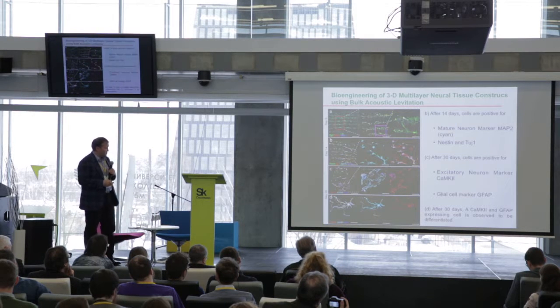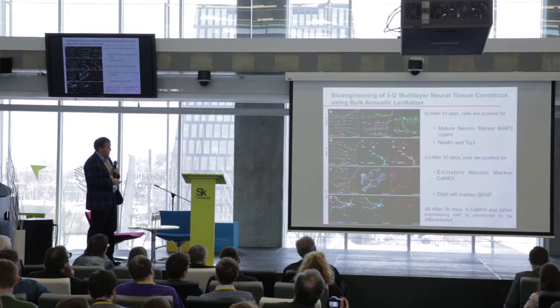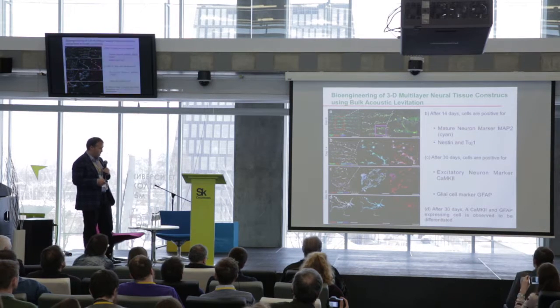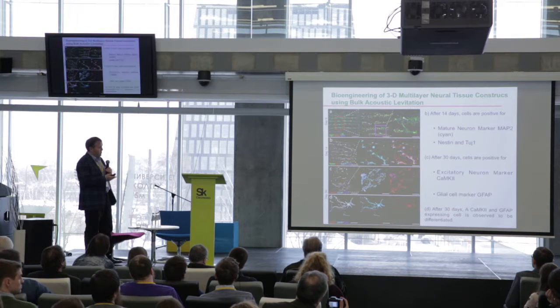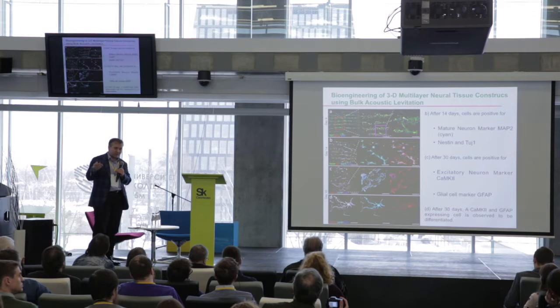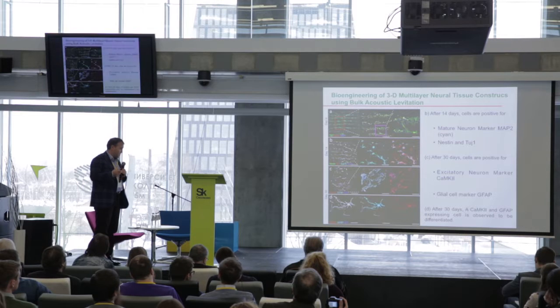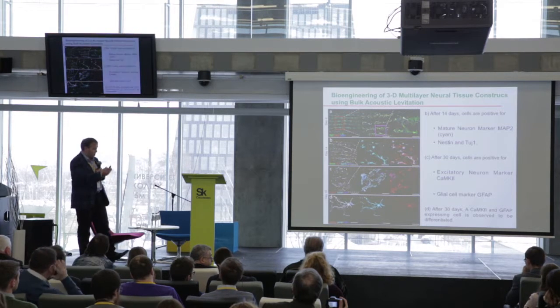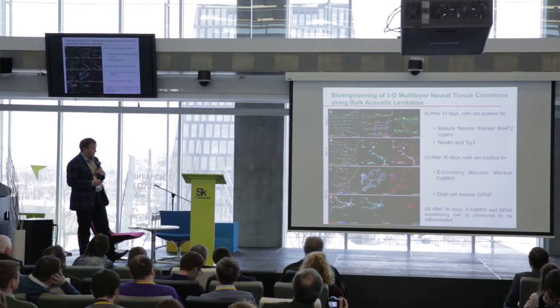But the bottom line is we have been able to take these cells and differentiate them over a period of 30 days, and these are biodegradable gels. Going above 40 days has proven to be challenging, but these were human cells, so we needed at least 6 months to really differentiate them to be functional neurons, and that's why we now have switched in the lab, again, back to mice, which mature much faster, and working with primary cells to show that these actually are neural circuits.